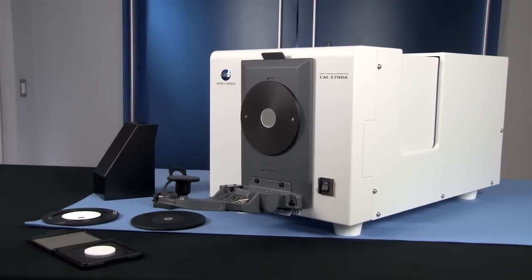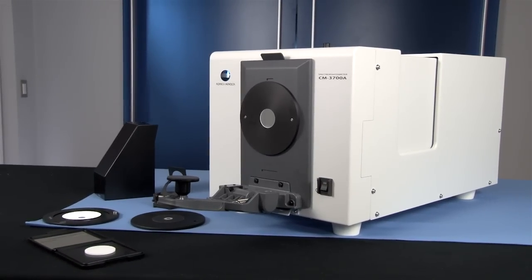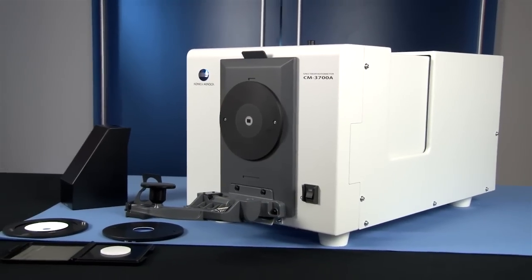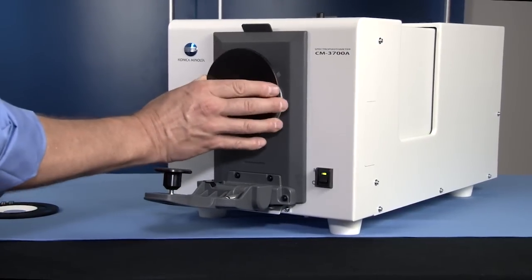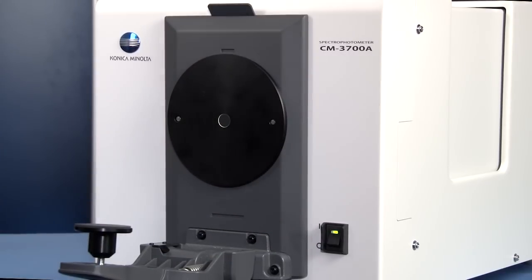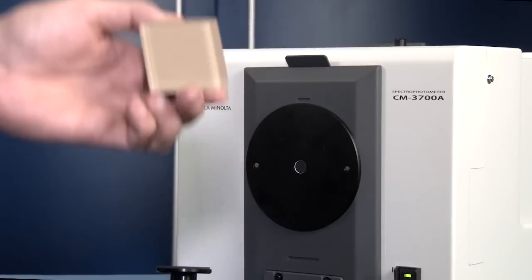Three aperture size options are available to meet the user's sample and application needs. Once selected, the CM3700A automatically detects the aperture size and communicates this to SpectraMagic NX for improved user convenience.